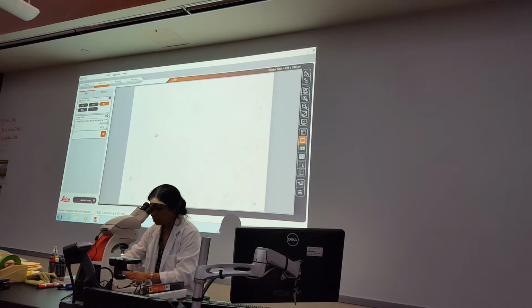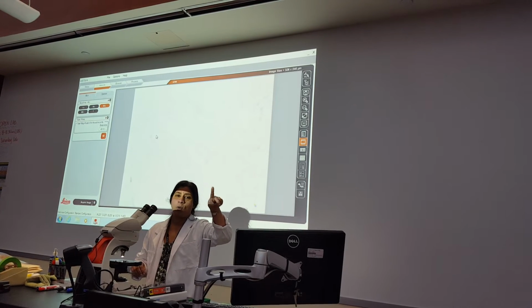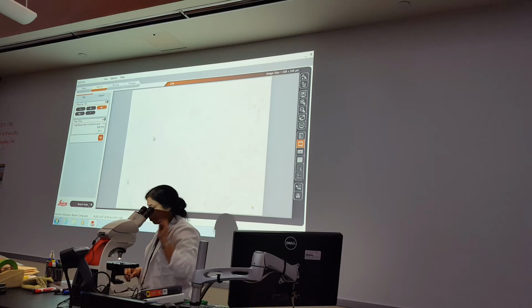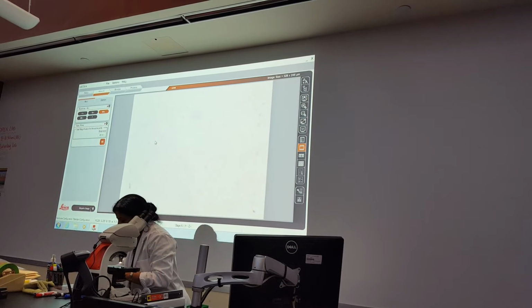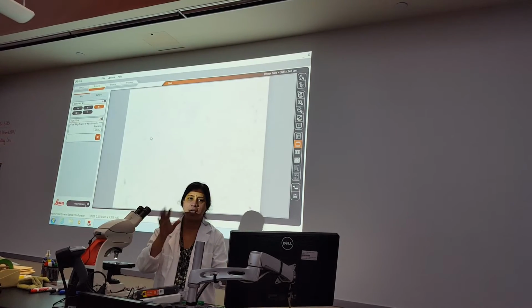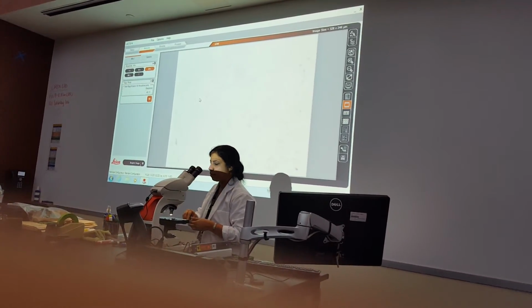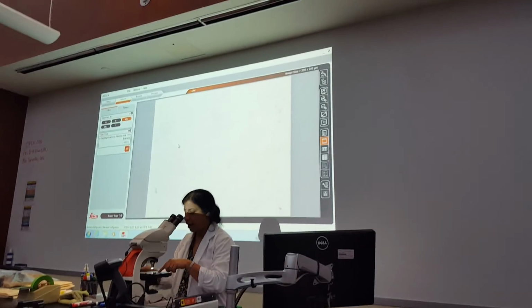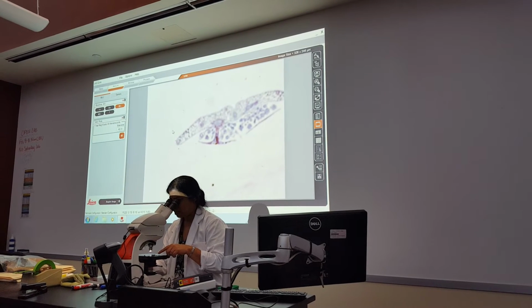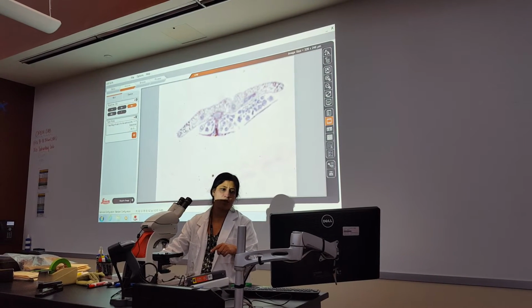So you did Selaginella and Lycopodium, where you're homosporous and heterosporous, right? Then which slide did you come to? The fern. We did the fern. So the fern sporophyte is a plant you see. If you flip the fern sporophyte, what do you find there? The brown ones. The sori, right? Sorus or sori. This whole thing is a sorus, right? The whole thing is leaf plus sorus.